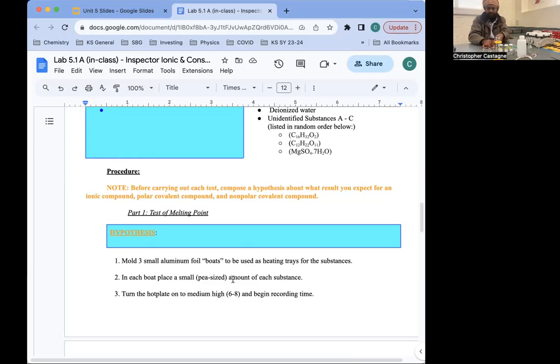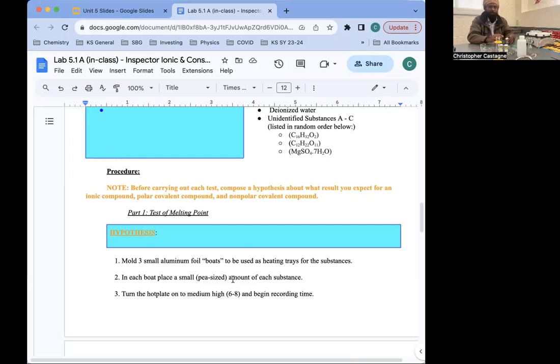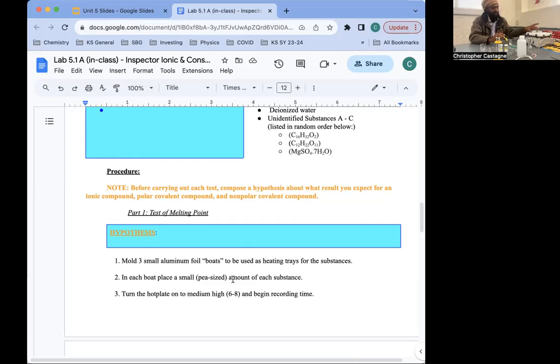Foil has a shiny side and a dull side. I happened to put the shiny side outside, so I'll just do that consistently for all three of them, just in case that might make a difference. I've made my three foil boats. I want to put a consistent amount of substance in each and make sure I keep track of which substance I put in which. I'm going to have A in the back, then B on the left and C on the right.